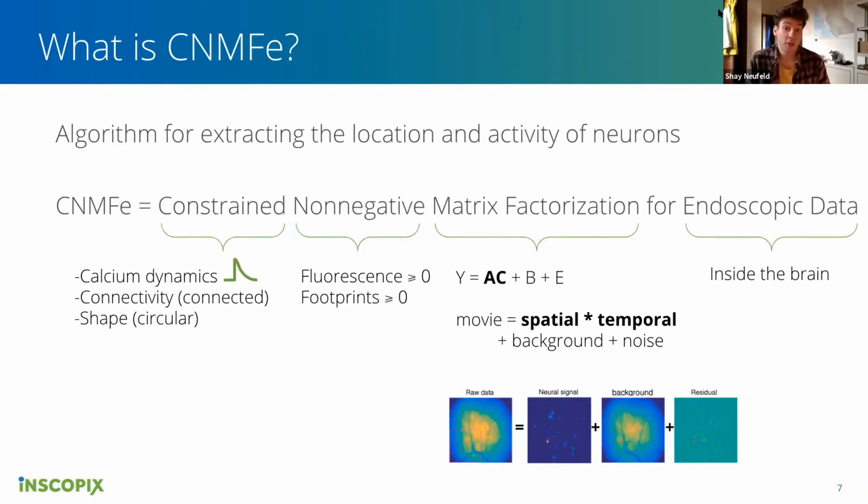Yeah, so it's always going to depend on the size of the data, right? It's going to depend on how big each individual movie is and how they're pre-processing it in time and space. There are definitely lots of recommendations we can give for decreasing that data size footprint to make it go faster.